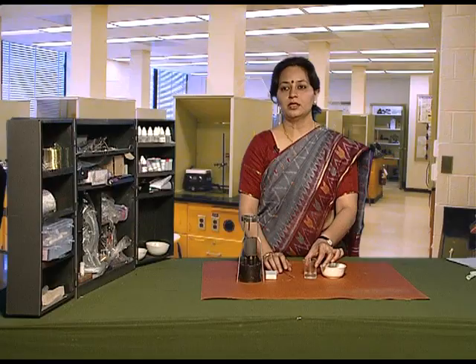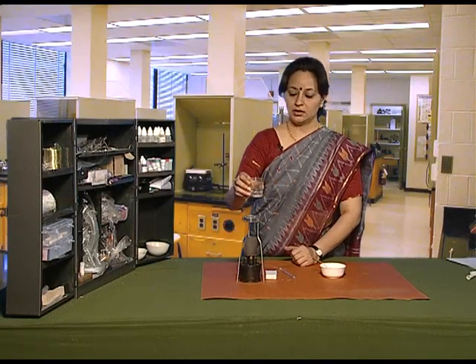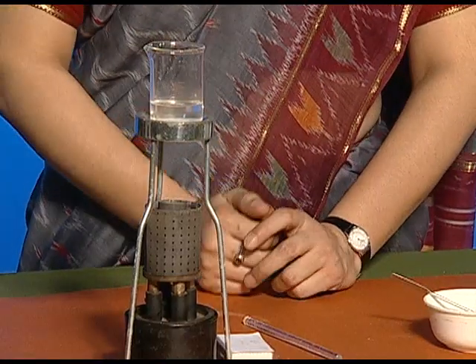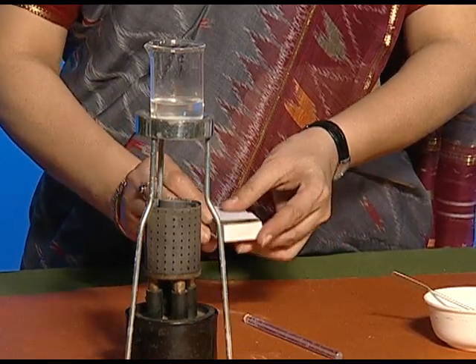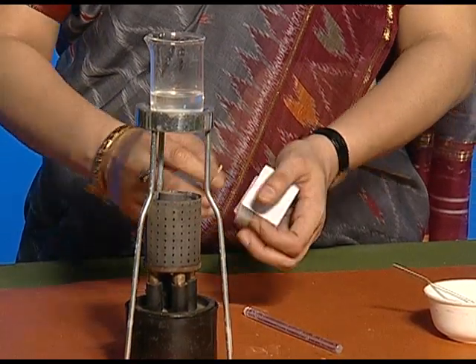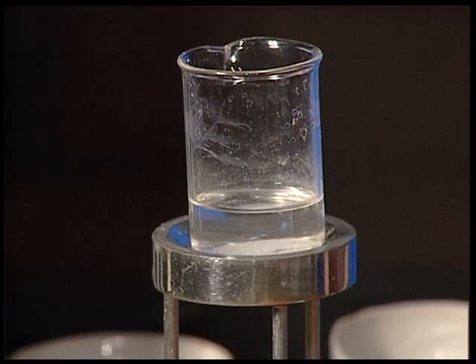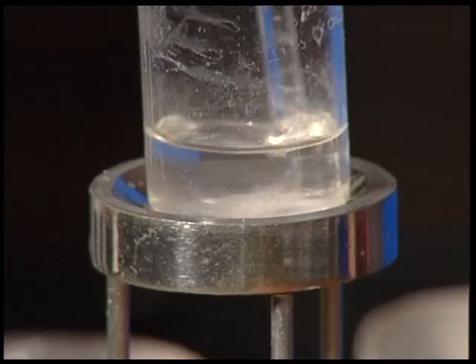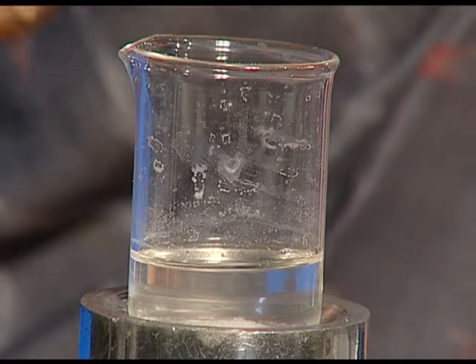If we want to further dissolve this salt in water, we will keep it on a tripod stand and heat it with the help of a burner. So we will switch on the burner. We will see that salt starts dissolving in water, and now this saturated solution has become unsaturated.